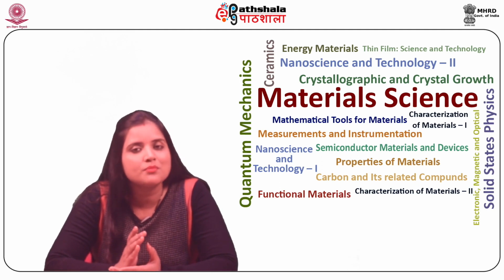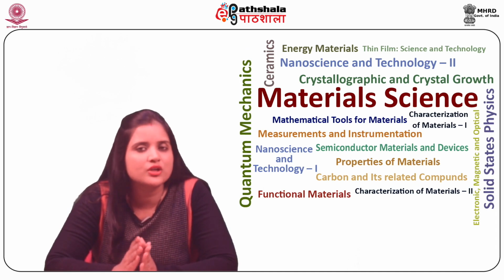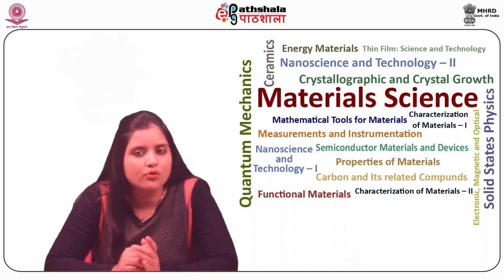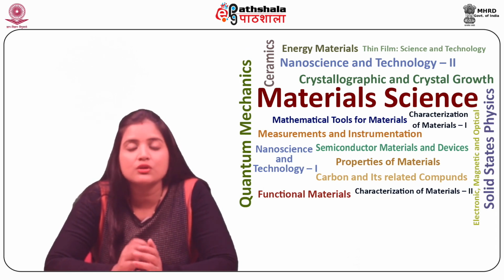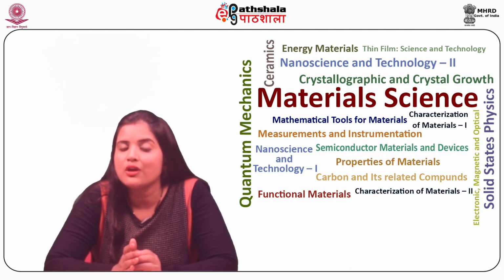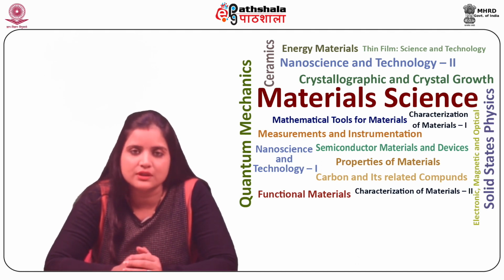Present-day SNOM designs closely resemble Synge's original idea, as hundreds of research groups throughout the world use SNOM's combination of optical characterization with nanometer spatial resolution to investigate a wide range of surfaces.